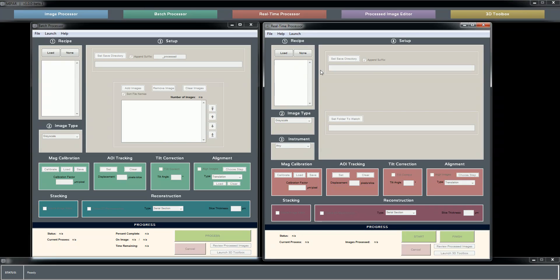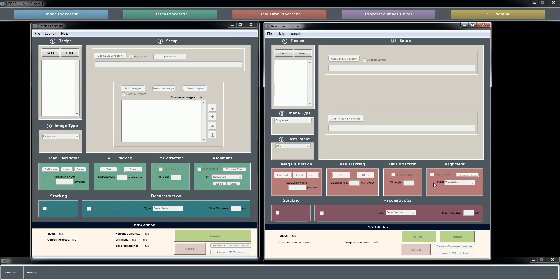The primary difference is the batch processor will process images post-acquisition from, say, a folder or a multi-selected set of image files, where the real-time processor monitors a folder, say, on a data server. So as new images are added to the folder, it sees that new image as it's added and begins processing it according to the steps that you've set up.